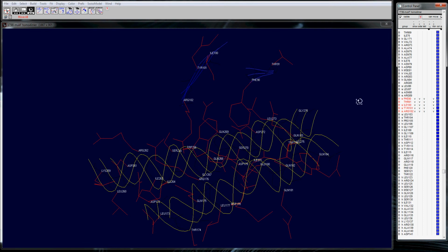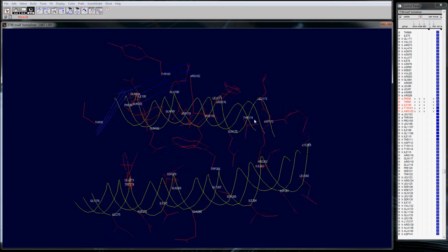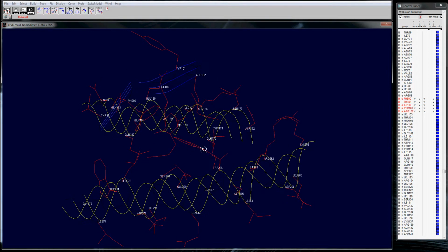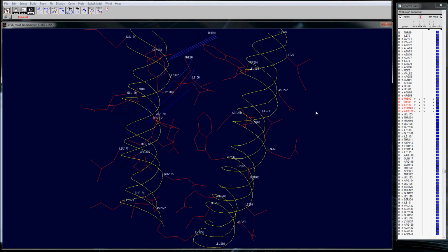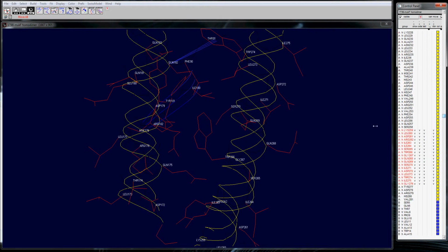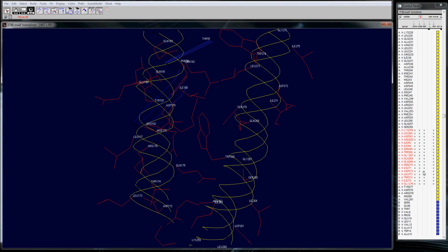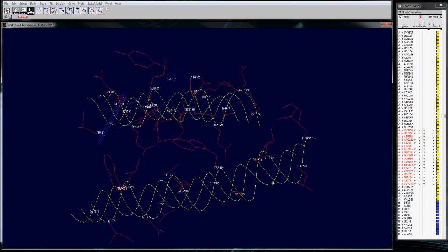Oops, that's not disappearing. So now we have the region surrounding that tryptophan, which is right there. And this is, again, a lot busier than we want it to be, so we can start to pare it down using the same method as last time. So we'll go up to our 200s and we'll say, okay, we don't like 268, so that one is gone. 260, what is that, 264, gone. 261, gone. And then we slowly just start to pare this thing down until we have a very simple active site.